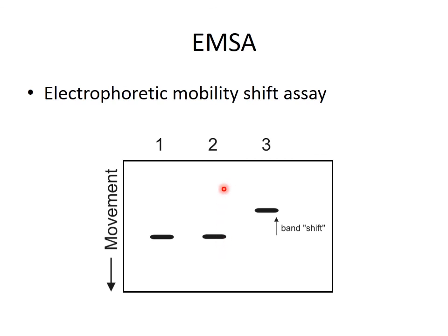If DNA was interacting with that partner, let us say a protein, then if the protein was able to bind to DNA, then it will form a complex and the size of the complex will become more. When the size of the complex becomes more, its migration rate will become less. So this DNA will slow down and its migration would become less, as represented here in this lane 3.